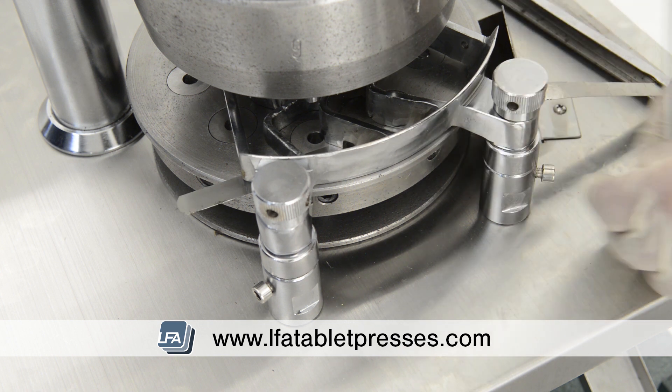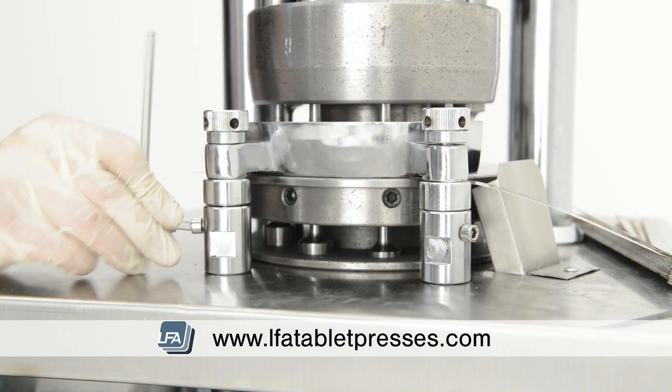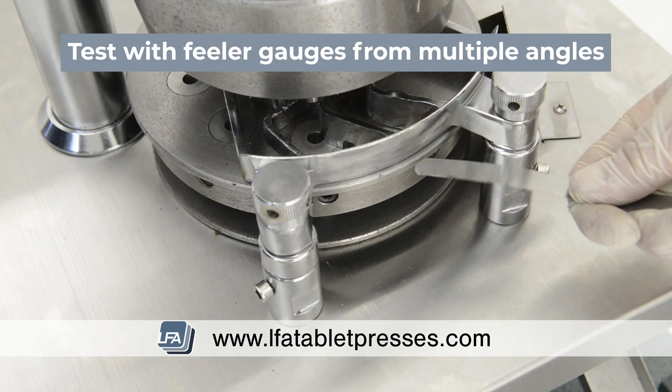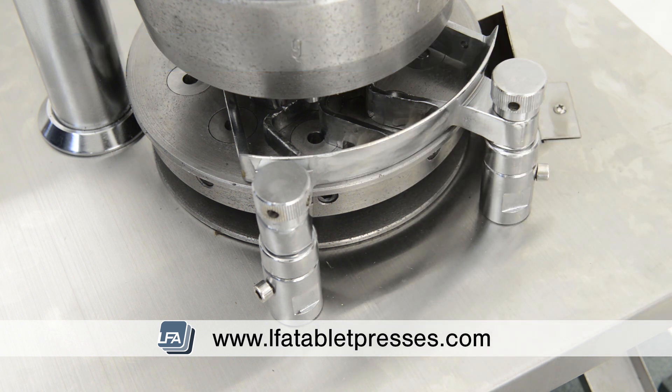Now we can tighten the feeder tray fitting parts again with a 5mm allen key. Once complete, use your feeler gauge around the feed tray from different angles. If you find you're losing an excessive amount of formulation onto the die table, we can use a lower setting on the feeler gauge. It's important to do this in small increments.